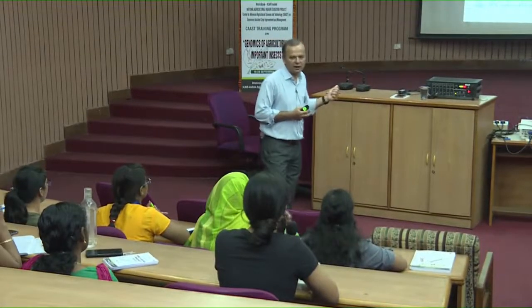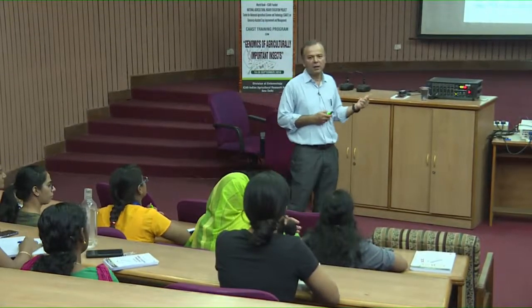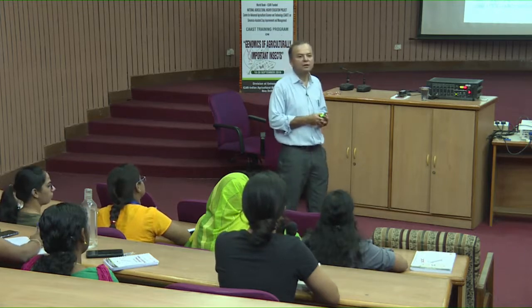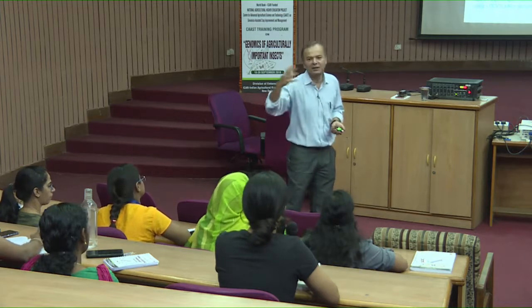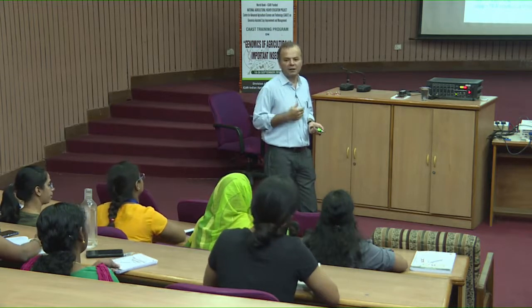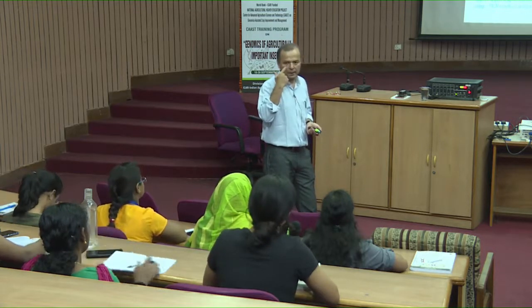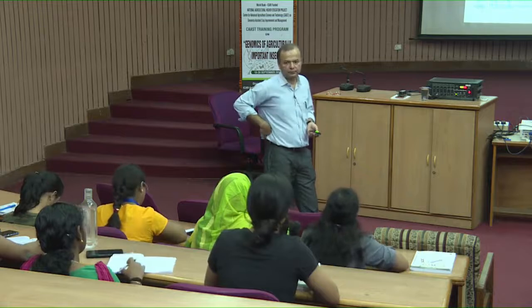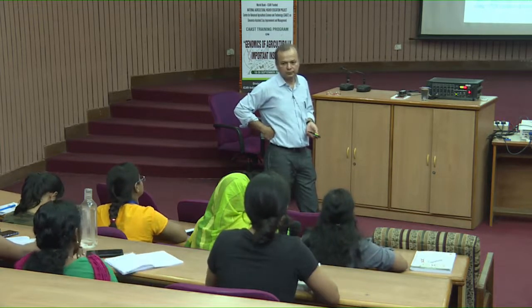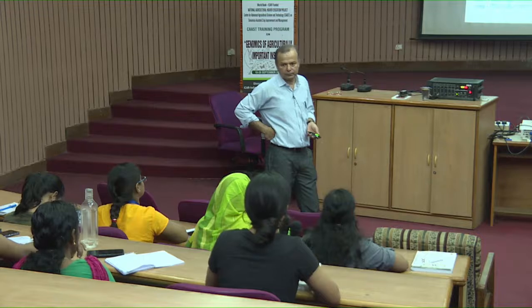We cannot arbitrarily say that it has to be less than 1000, because here we are talking about the cDNA amount, isn't it? So, always what will be the target mRNA present in that amount of total cDNA, that always matters. Yes, you are right. Can we go with quantifying the total RNA and the cDNA? We can abide by the readings of the others. Like what is the quantity?